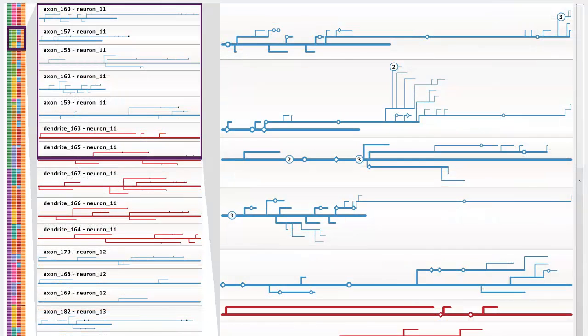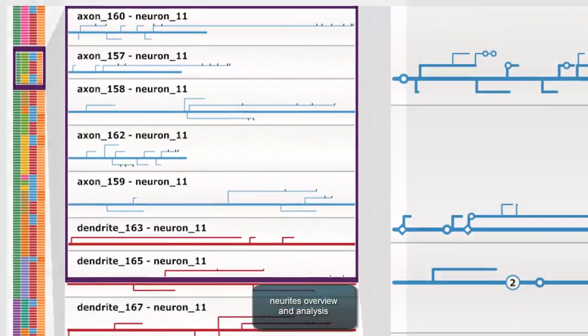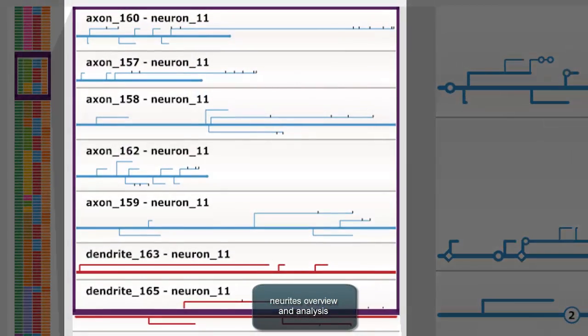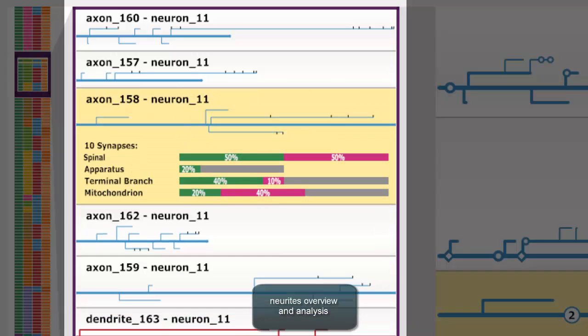The middle view is the neurite overview window, and gives a high-level view of individual neurites. It depicts neurites at a medium level of detail, without the full detail of its branches or individual synapses. Additionally, it can show detailed statistics for a neurite and all its synapses.